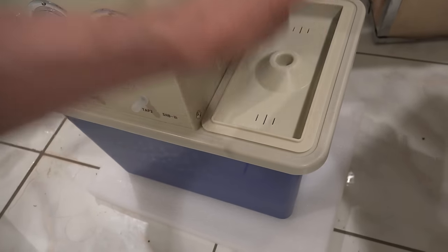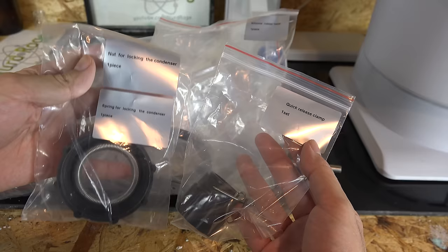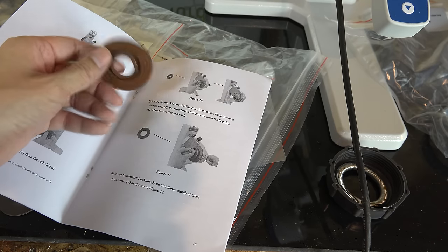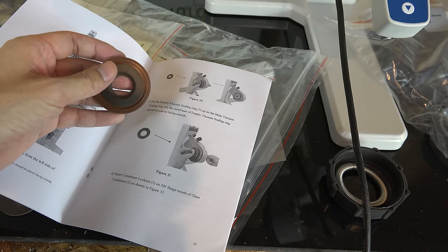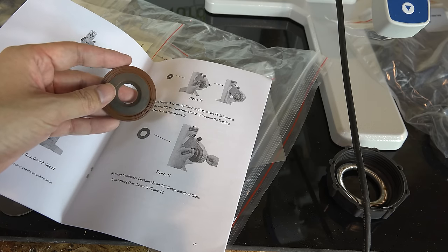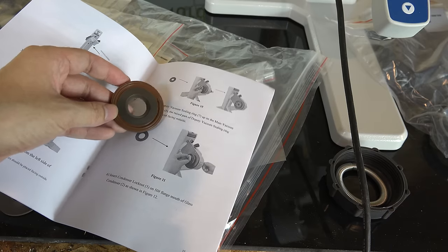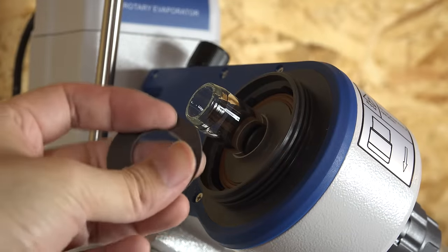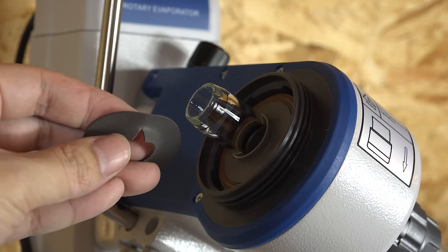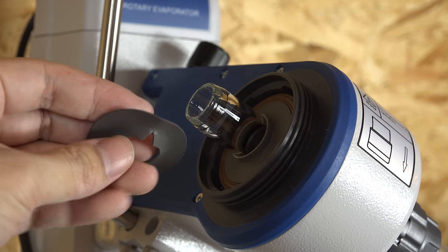All parts seem to be properly labeled and packaged — everything is here as it should be. One thing I don't like is that the pictures in the instructions are very low resolution black and white; I would have appreciated high resolution full color pictures showing exactly how everything fits together. Fortunately I have assembled rotovaps before during my professional career, so this was very easy. But if you're assigning some intern fresh out of undergrad to set this up, these instructions could be better. I hit a hiccup with a sealing ring tearing open — this ring maintains the vacuum between the moving parts. Fortunately the company knew this was a weak part, so they included a spare ring which I've already installed.